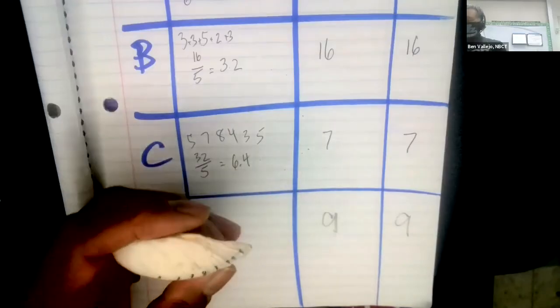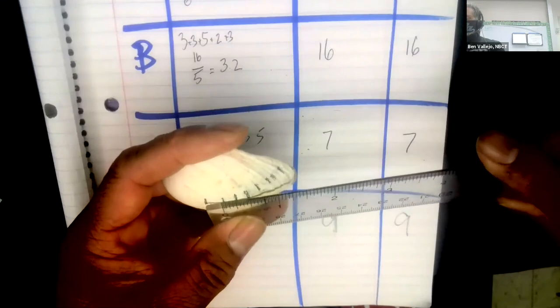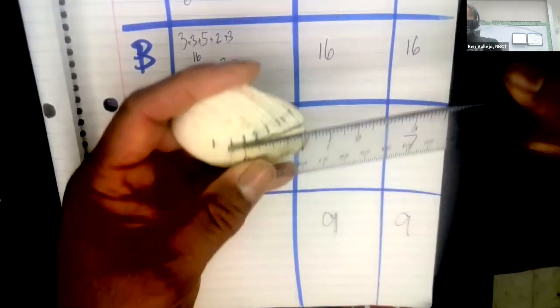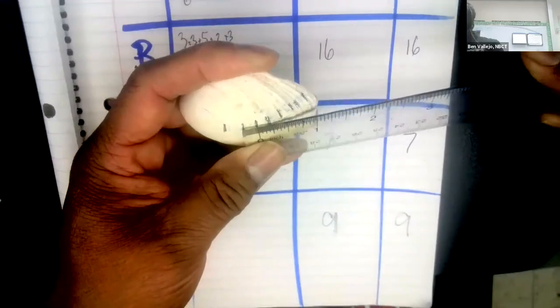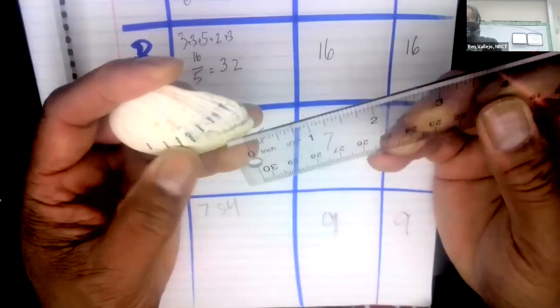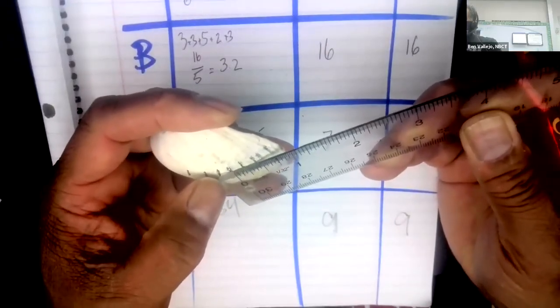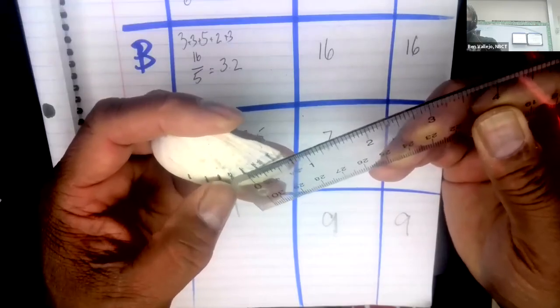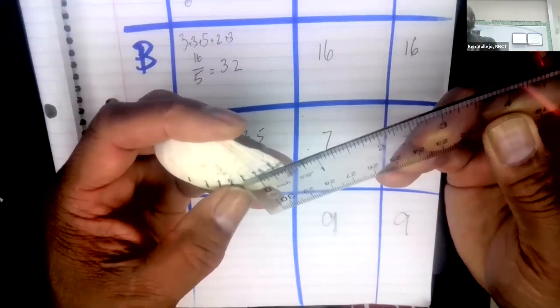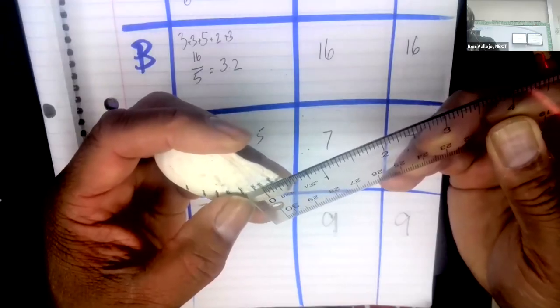Okay. You got 7, 5, 4, then it gets smaller. 3, 4, 3, 4, 3, 4, 3, 4.